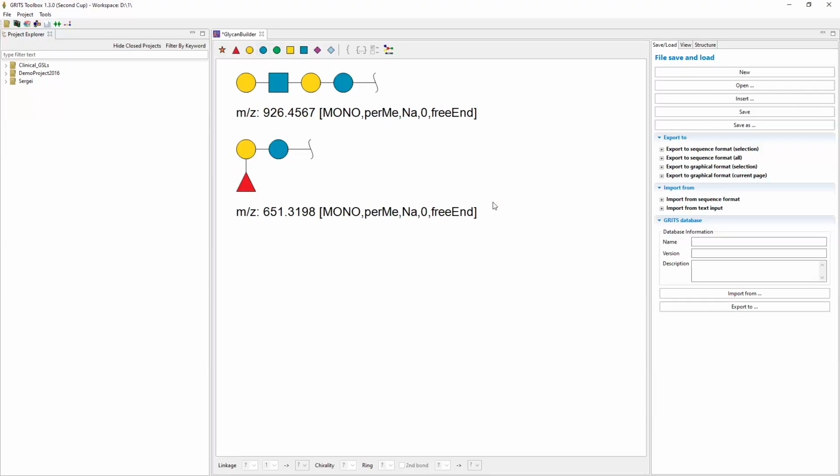Okay, do you have any questions so far about the drawing tools or something like this? I will give you all like 3 or 4 minutes to explore them, at least the web tools, so you can play around a little bit with them, and also give you the time to think a little bit about questions. And if you don't have questions in 2 minutes, then we will continue with the next.